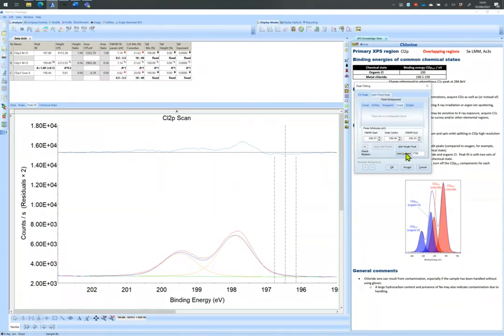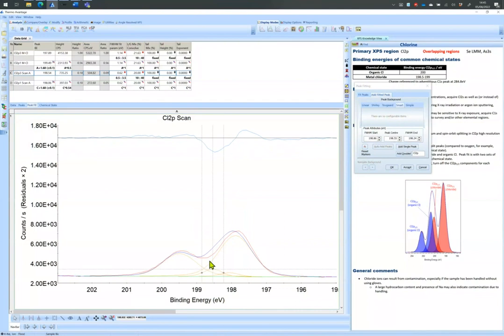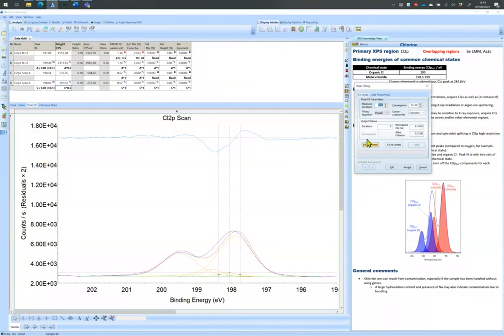198.5 eV. As explained before, the rule of thumb is that all peaks or doublets usually have the same or similar width and Lg ratio. This is done by writing A times 1 in the cells shown. Again, change the height constraint to 0.5 instead of the 0.54 for this new doublet. Then fit this level and wait for the results. Wait a bit longer. The result of the fitting model matches exactly the data.